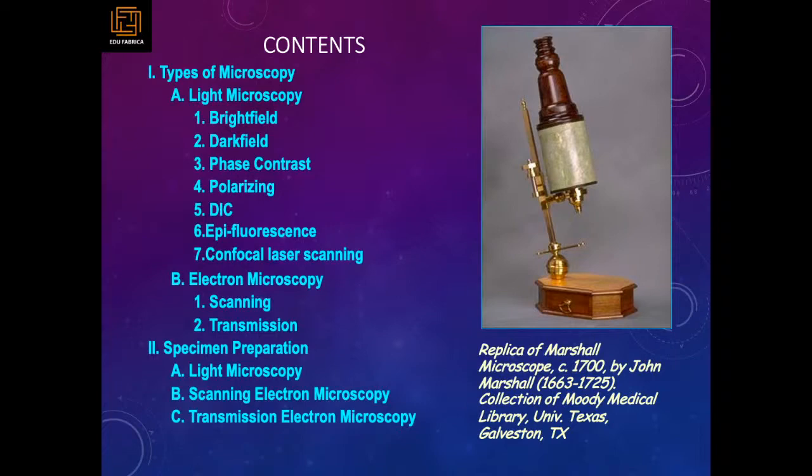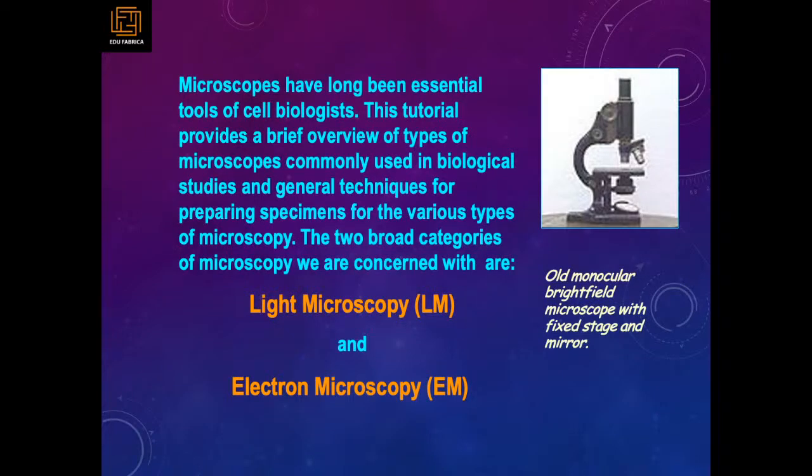So let's start with an unusual microscope. This is an old monocular bright field microscope. So in the very old time, that's how they looked. Maybe from the World War time, I think this used to be.